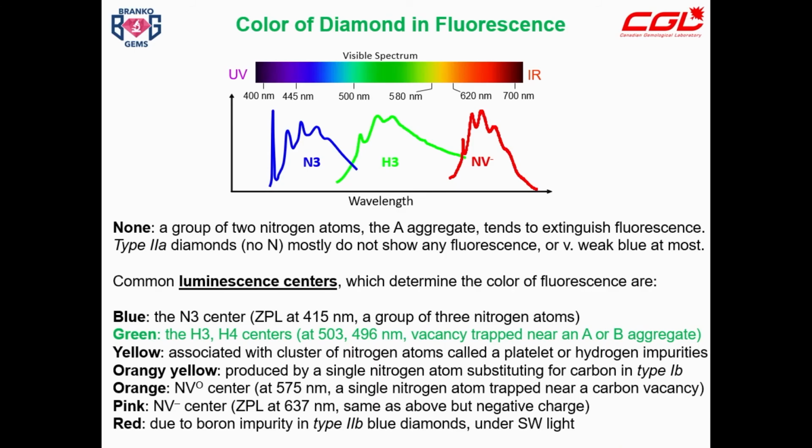And we look at these diamonds with, of course, spectrometers if you are in the laboratories, but this lamp is very powerful because the color of fluorescence reflects really what is the composition of a diamond. So generally speaking, blue color is a good indication that we're dealing with natural diamonds, especially when you have medium to strong fluorescence. Green, as you can see here, is caused by different impurities in diamonds, and usually it's an indication of some heat in a diamond, due naturally or artificially, so it could be treated. Orange, yellow-orange fluorescence, most often it's an indication, again, of treatments in diamonds.